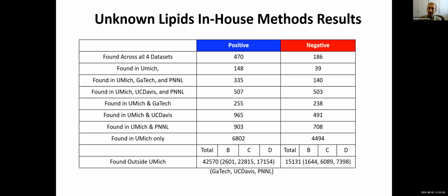And so I think it speaks a fair bit towards the potential of common data processing pipelines for metabolomics to improve reproducibility in feature detection and feature alignment between labs. There are certainly hurdles that remain to be overcome, but I think it's shown that there is potential.